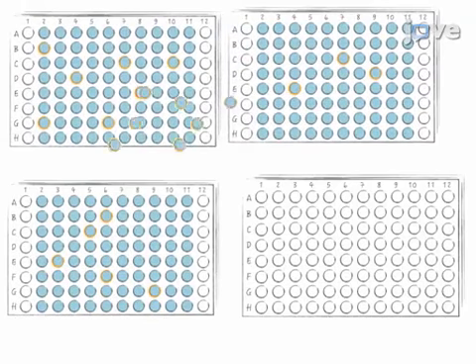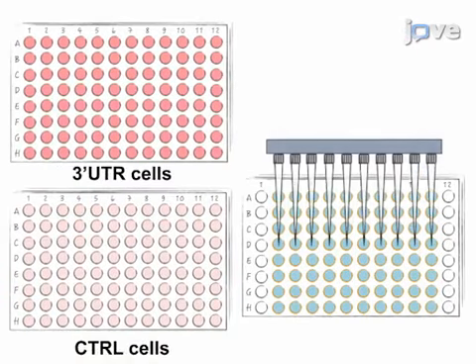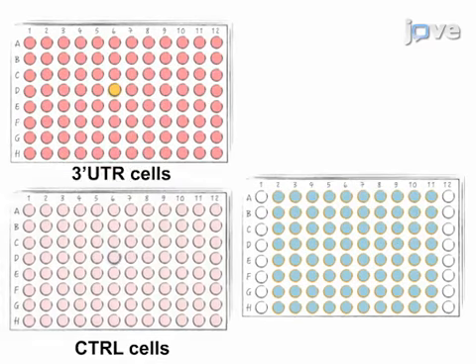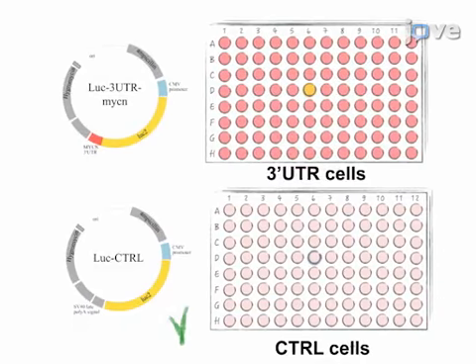Cherry-pick the selected molecules for further validation screening, and next, treat both the control cells and the cells carrying luciferase 3' UTR chimeric transcript with a cherry-picked library subset. Results will differentiate if the effect of a compound is mediated via the 3' untranslated region or via other vector sequences.